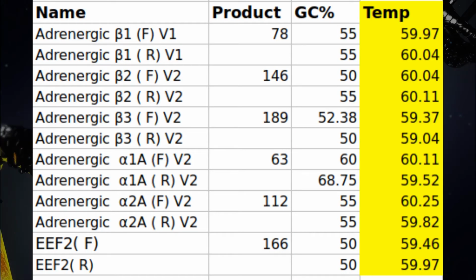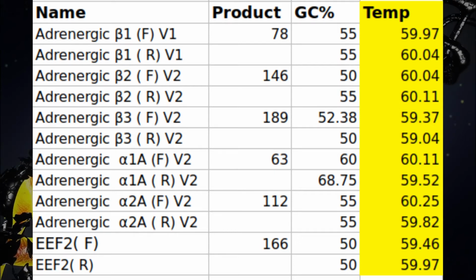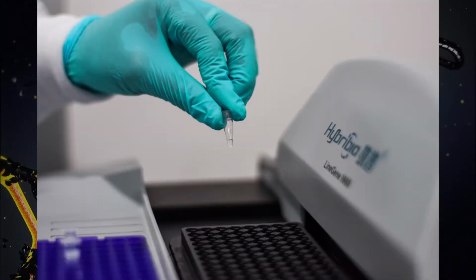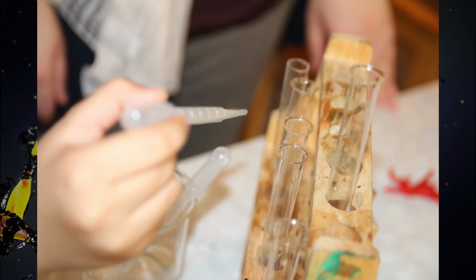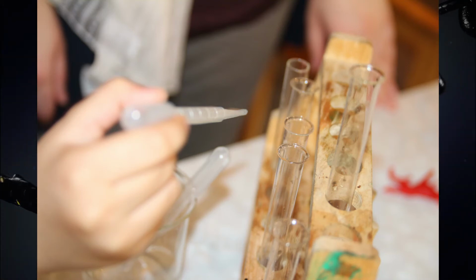This means that you need to find a way around the bottleneck, that is, the temperature-mediated changes. All the primers have to be designed so that they all work as close to the same temperature as possible during the PCR cycle. This is the weakness of multiplex PCR. The strength is that if you have a limited sample, such as archaeological or anthropological remains, it is possible to get a lot more data out of a much smaller sample.